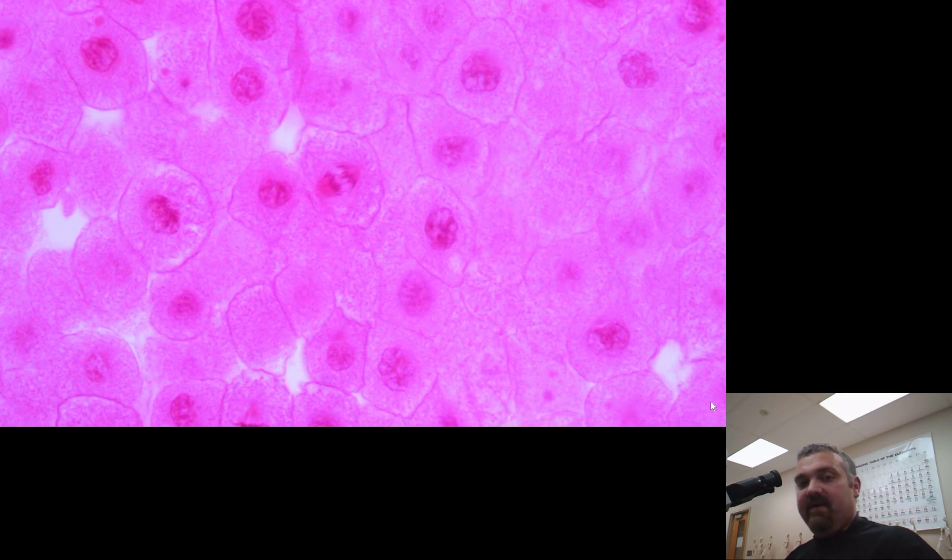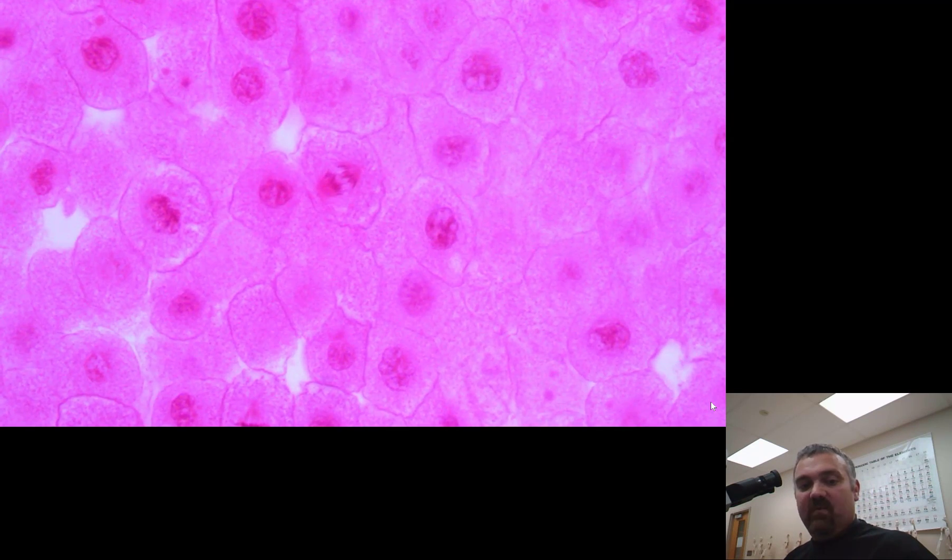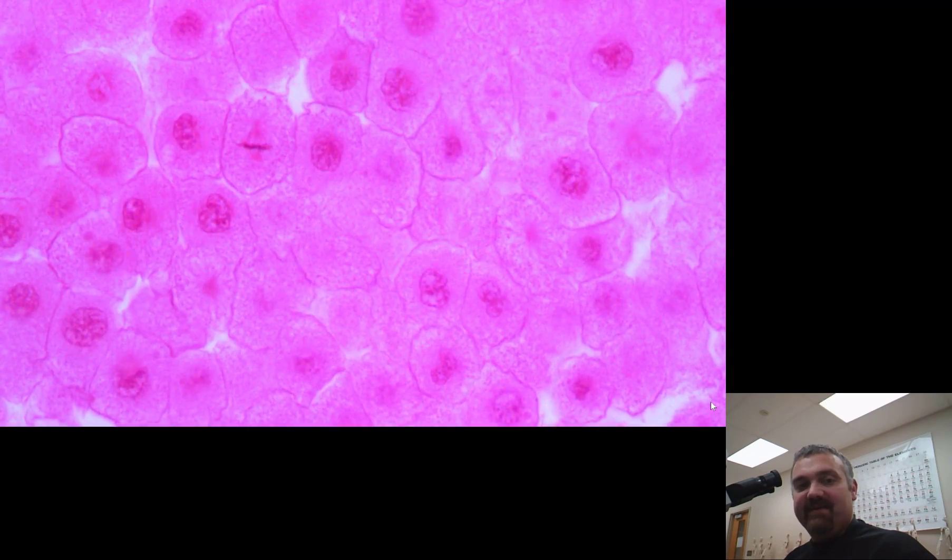Jumping ahead to the high dry power objective. Let me change the lighting so you guys can see it through the camera. We're already seeing, smack dab in the middle, really cool things happening here.